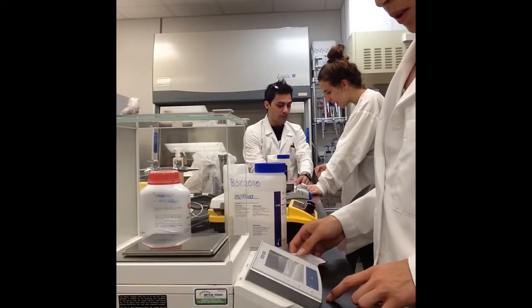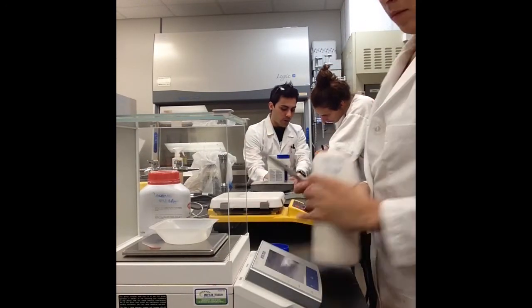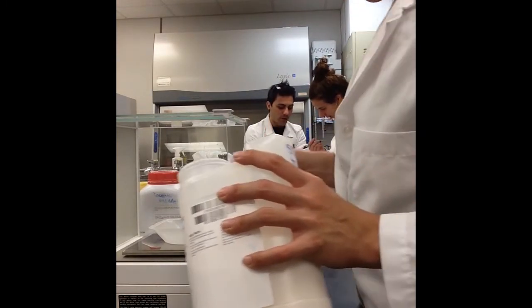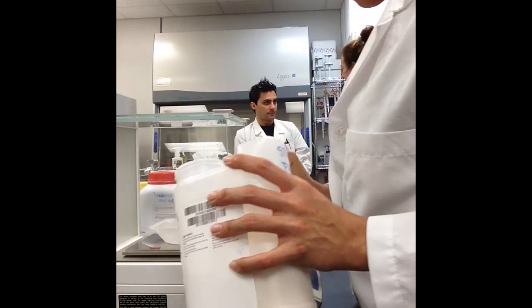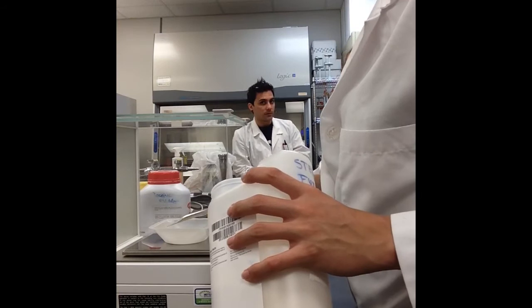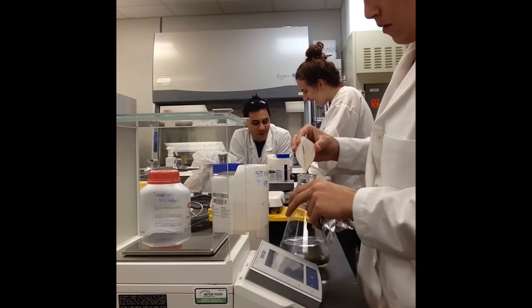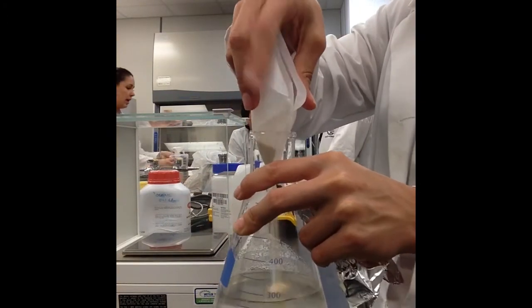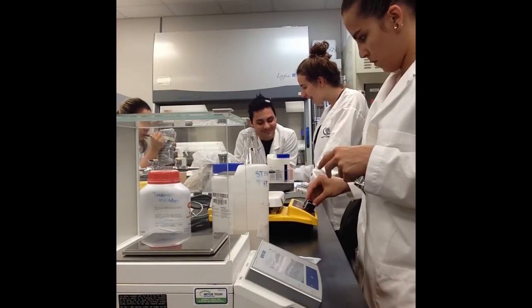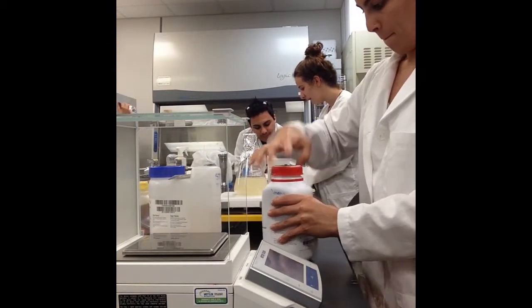After we placed the 250 milliliters of distilled water into each Erlenmeyer flask, we went ahead and measured out 3.25 grams of nutrient broth, as well as 3.75 grams of nutrient agar. Both of these are dehydrated. We tared our scale to 0, measured out the weighing boat, tared it to 0 again, and then slowly began to add into the weighing boat 3.25 grams of nutrient broth. First, we added the nutrient broth into each Erlenmeyer flask.